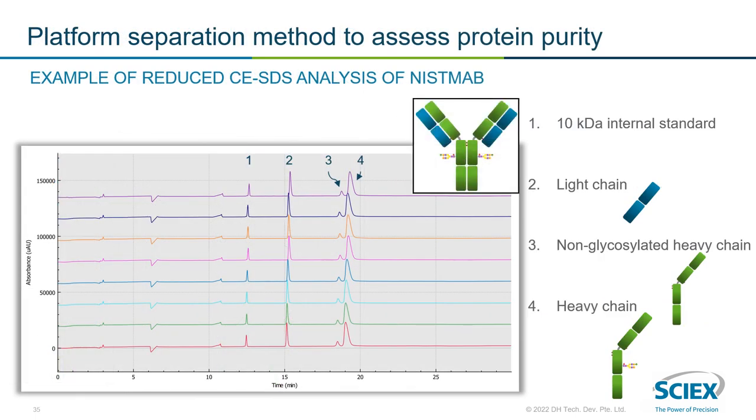Here's an example of eight replicates analyzed simultaneously with the CE-SDS impurity workflow performed on a multi-capillary SCIEX instrument. As we discussed, this methodology is used to determine impurities within therapeutic antibodies. This assay is the industry's gold standard for monoclonal antibody characterization and QC lot release.